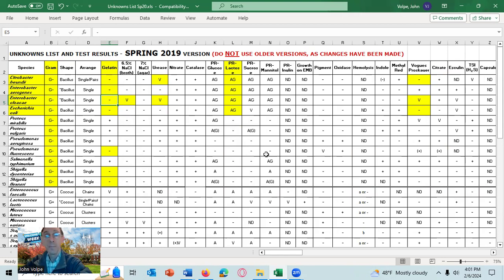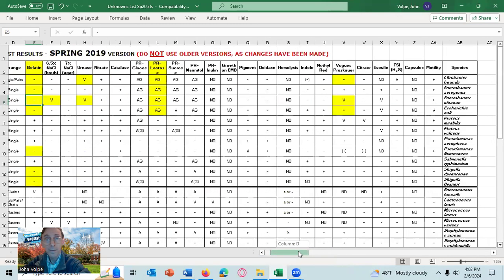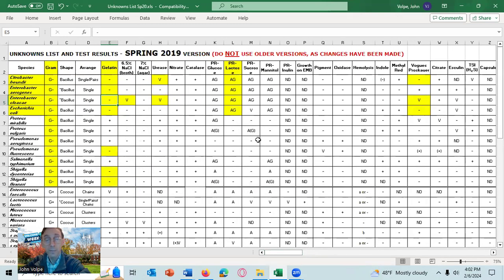All right. But generally, these are the results you actually see in Bergey's manual, with maybe 1 or 2 exceptions in this whole table. And as you can see, there's a lot of results in this table. It's in this top part here, and we're not even seeing all of it. Like I said, there's only 1 or 2.